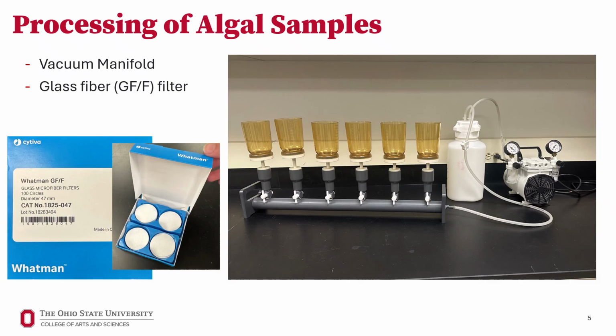One easy way to think about this is that it's similar to a coffee filter, where the water is able to pass through the filter, but the larger coffee grounds are stuck to the top of the filter. In this lab, we will be analyzing the algae on the top of the GFF filter. However, it is also possible to study the filtrate, or the liquid that passes through the filter, which contains particles small enough to pass through the filter's pores, such as bacteria, as well as chemicals and minerals that are dissolved in the water.